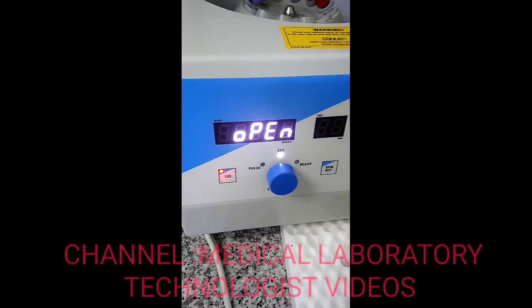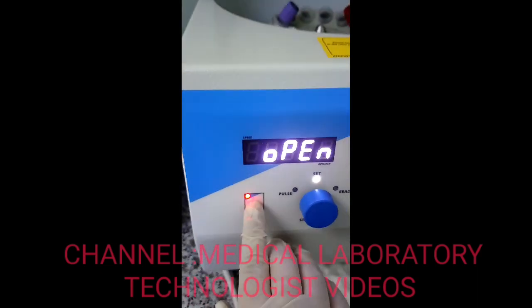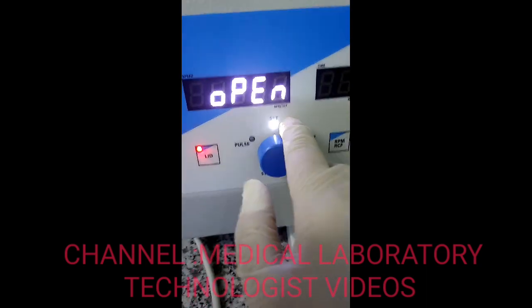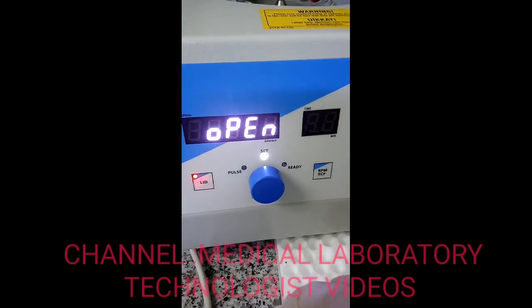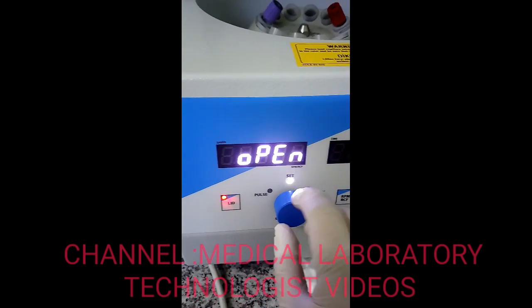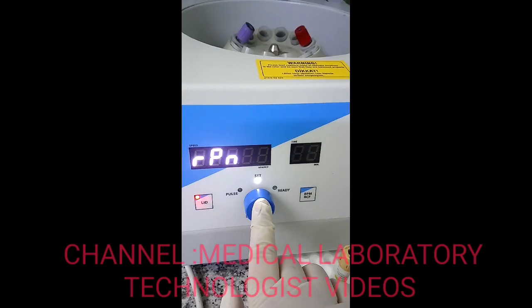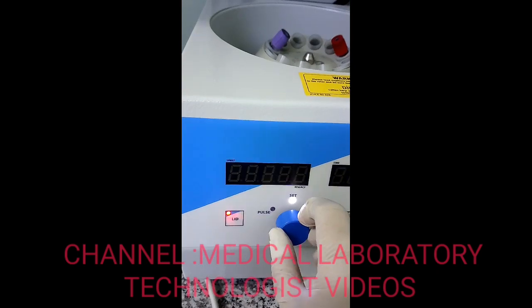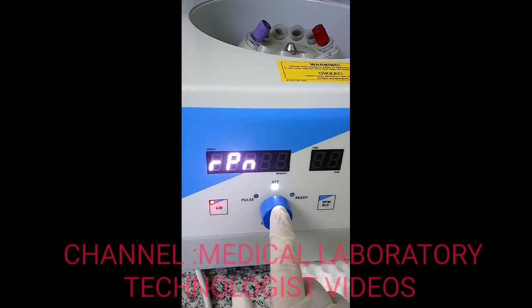There are two LED lights: one shows the lid button status in red when it is open, and the other is for programming. To program the device, go to options and select either RPM or RCF. I want to use RPM, so I will select RPM.